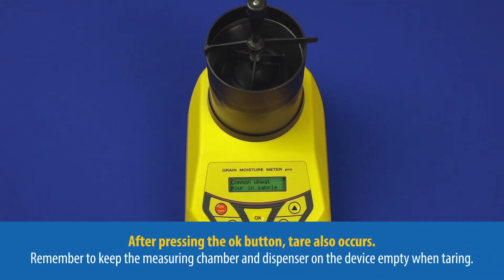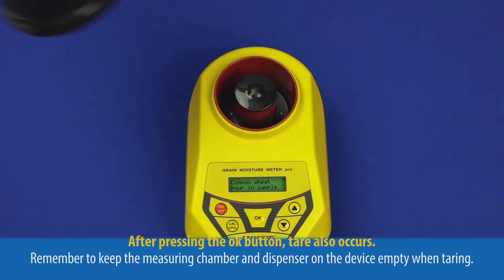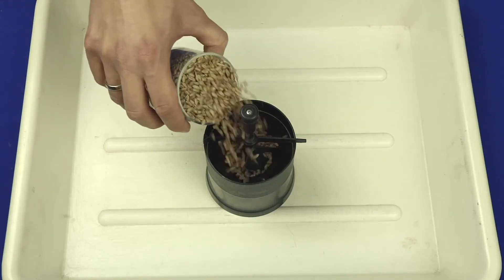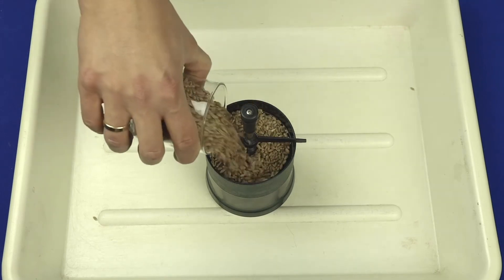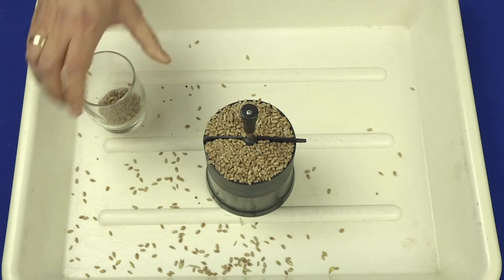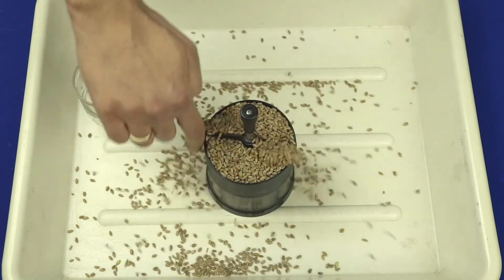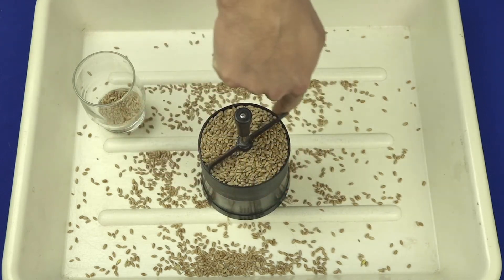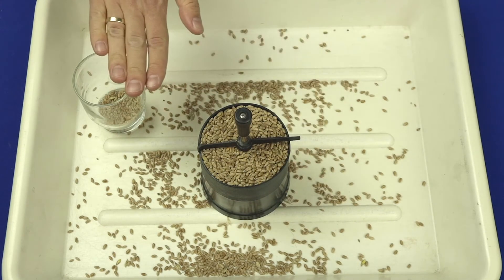It's going to inform you to pour in the sample. Fill in the dosage tube with a surplus and remove the surplus of the grain so that the sample is filled in evenly.